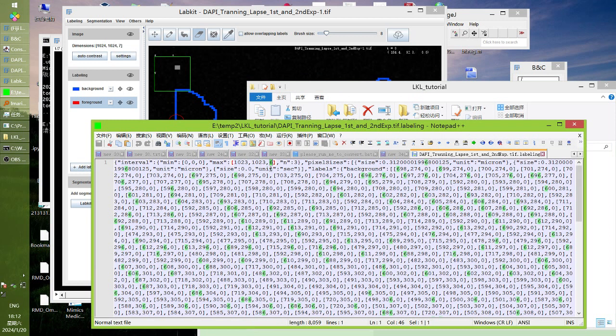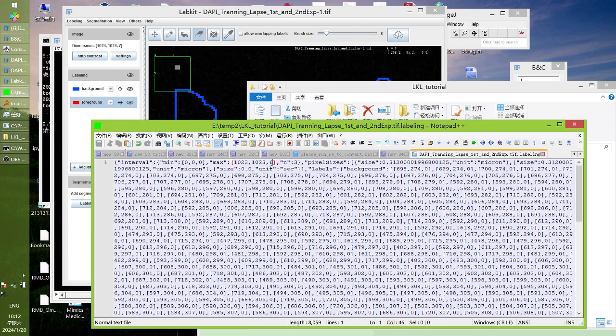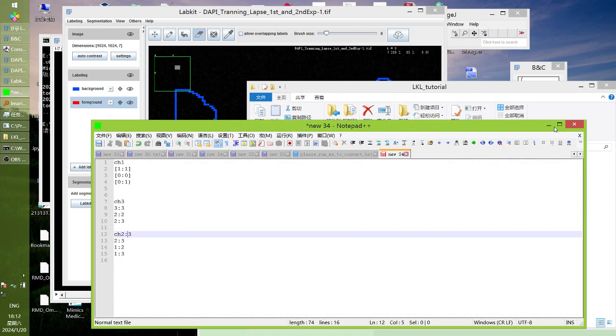And if for the third experiment you pick 5 representative TIFs, you just add this 5. So 6 plus 5 is 11, and save. That's how, before you train again. Because this is already 6, I will not change it now.